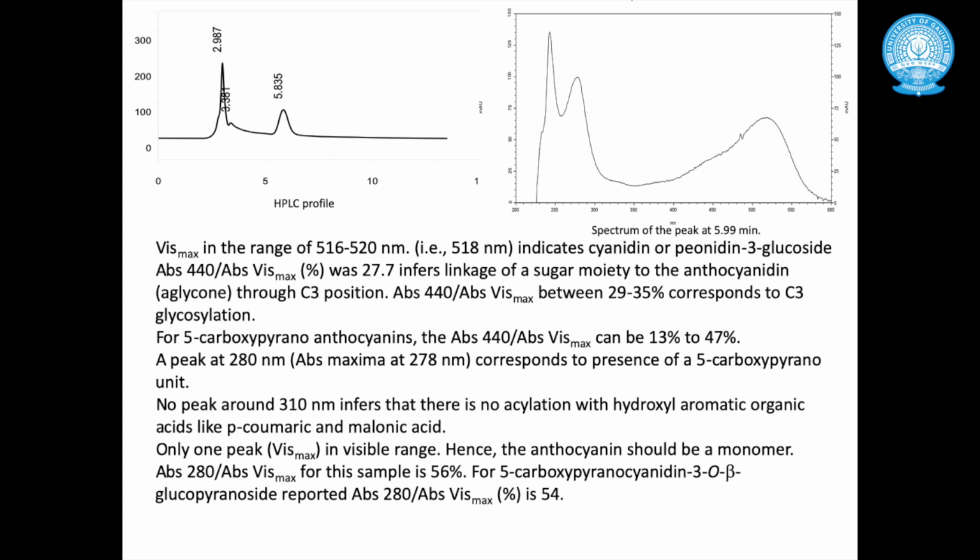So in this profile, what we see at 5.835 minutes of retention time is a peak, which is indicative of a singular peak. And before that, whatever peaks we are getting at 2.987 and 3.381 are not clear about their identity. So we will focus on this peak, which is at 5.835 retention time.